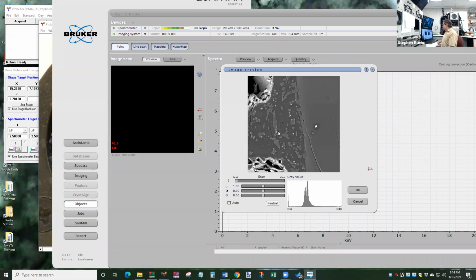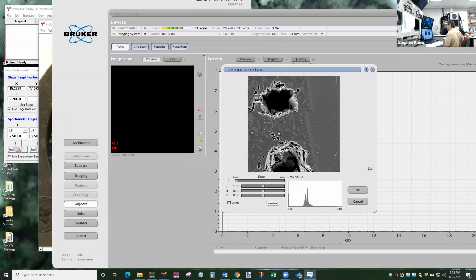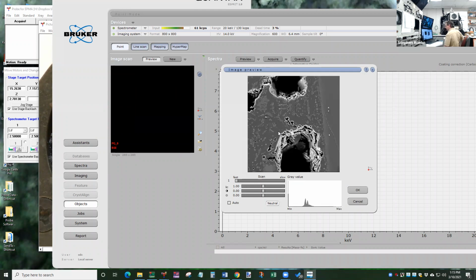Okay. So we have here what we would call some big crystals. You can see there's a huge difference in size. The large ones don't even fit in the view. I could zoom out so we can see more, but still, it's just not going to all fit. It's a couple of millimeters across, and the microscope can't actually zoom out to see something that wide all at once. But then the stuff in between, like all those big crystals, there's some holes in there, and then there's all kinds of little tiny crystals.